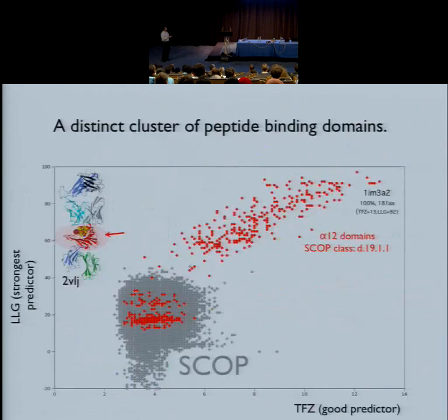So we run this wide search molecular replacement, and this is the solution. This is what we get. Ignore colors for a second. We really have this one big set here of what we potentially suspected are the solutions. And if you notice here, the TFZs range from 12 to close to 3 or 4. And all of them have elevated LLG values. And then we have this second subset, which we suspected are not the correct solution.